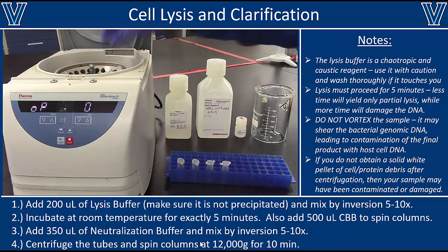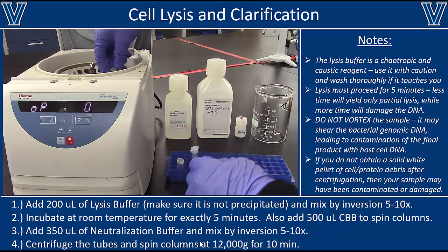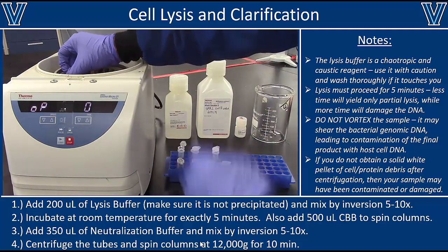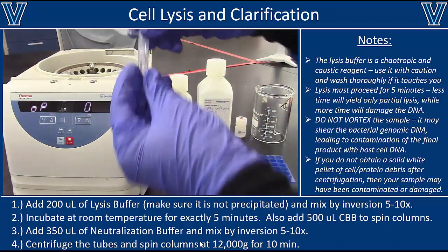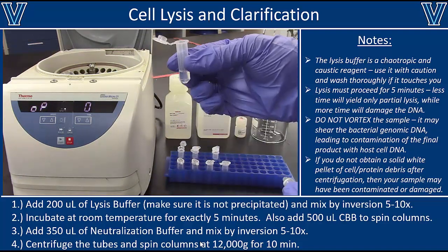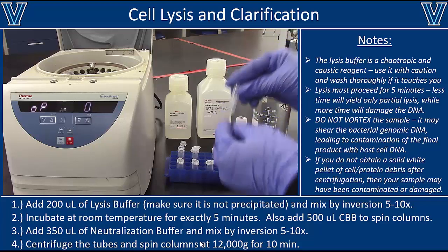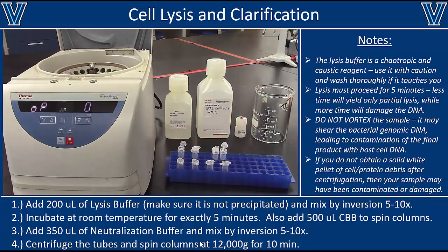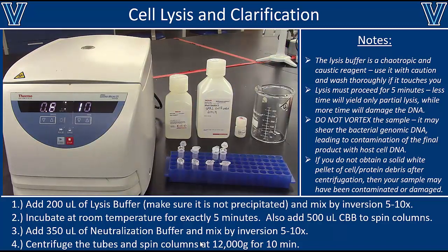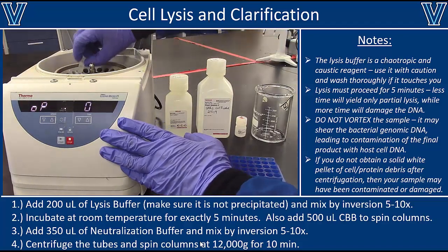If you like, after 1 minute of centrifugation, you can remove your spin columns from the centrifuge because that's all it takes to really get the column prep solution through that resin. You should see there's a liquid that's gone through into the collection tube, and you can just decant that into a waste beaker. Once you do that for all of your samples, you can then continue centrifuging for the rest of the 9 minutes that you need to pellet the cell debris and the other things that are in your plasmid DNA samples.